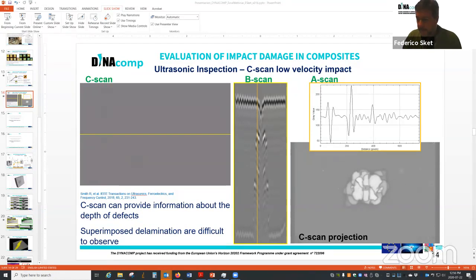Okay, understood. We have a follow-up here from Kenneth on his interest in applying the technique at high temperature, and the reason is work on self-healing polymers based on thermoreversible covalent bonds. So I can see now why he was interested in that, because he can produce the healing of the material by applying temperature. So it would be really nice to be able to detect these healing mechanisms by C-scan or by ultrasound inspection as he applies the high temperature.